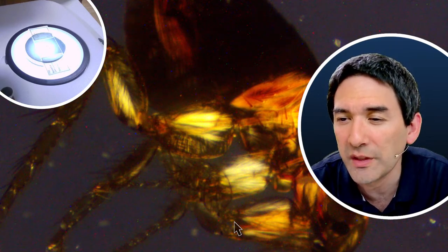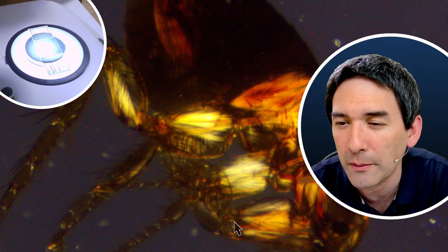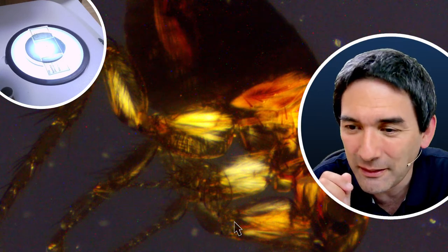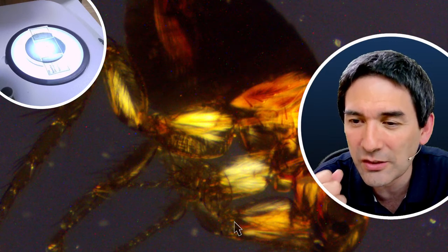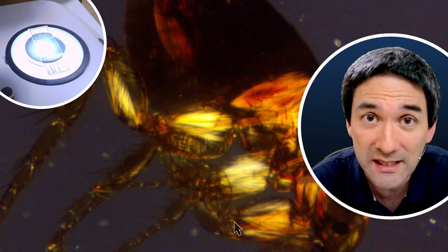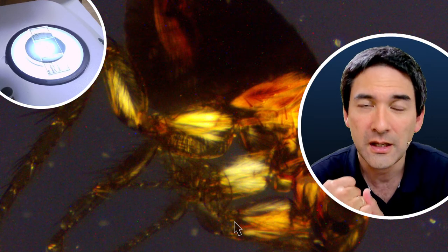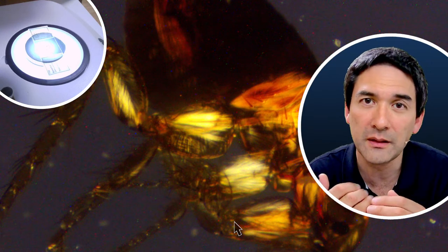Another question here: when smaller samples like crystals or salt are examined under light microscopy, will the polarizer and analyzer be required in order to see the polarizing effect? Yes, be careful here. Two aspects. So the question again is, when you look at crystals or salt under a light microscope, do you need a polarizer and analyzer? And the short answer is yes, if you want to get the nice effect here. However, not all salt or not all crystals are actually optically active. So it could be that some crystals essentially will not give you colors.